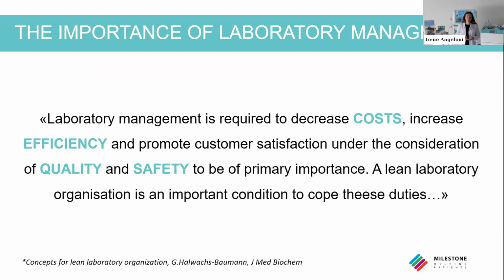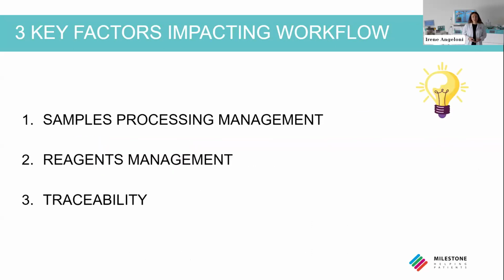So the laboratory management is required to decrease costs, increase efficiency, and I want to stress this point because it's very important, with quality and safety to be of primary importance. So to sum up, the key elements that we need to look at when we talk about laboratory workflow are efficiency, quality, safety, and cost.